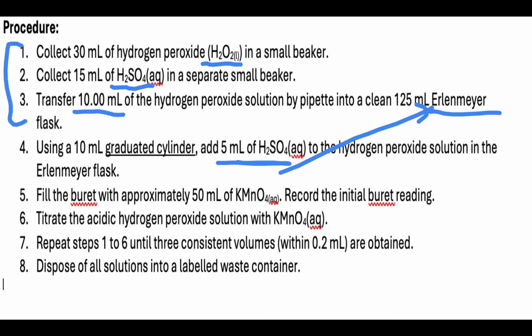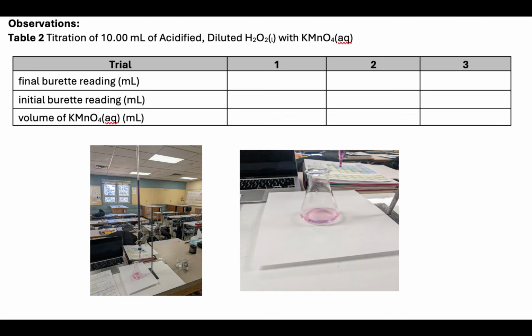And in your burette, we'll have the KMnO4. Then you will start to titrate, and it's a really dark purple. When you start the titration, if you see here, you have that KMnO4 is very dark. And then this part here is when your titration's over. So as you're adding that dark purple in, it is that clear solution. It makes the purple disappear. And then that one drop will turn it into a very nice light pink.